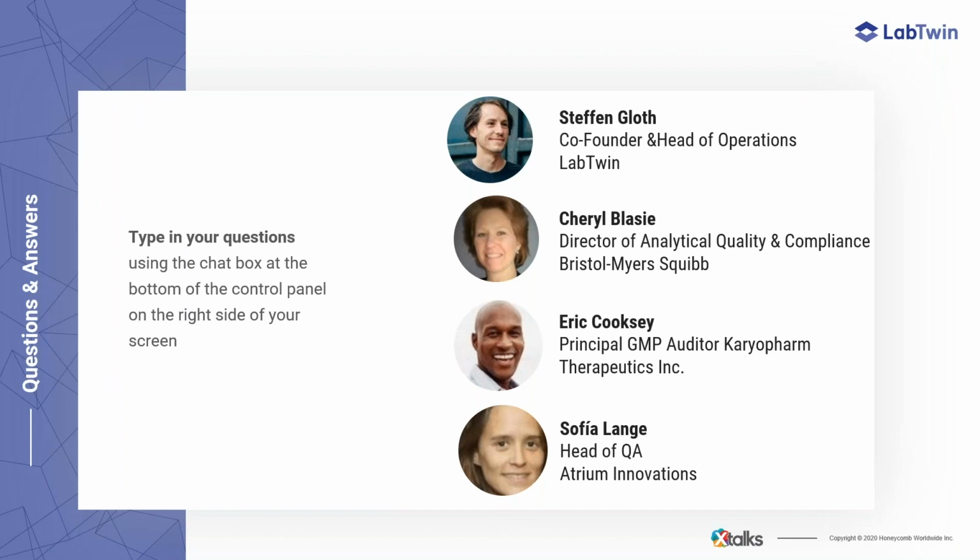I'll take that one, Andrew. I think if you have a specification and you have 15 test methods on your specification and you're utilizing 3 or 4 test labs to generate the data to complete that specification, it could be that all 3 or 4 of those labs are internal to your company.